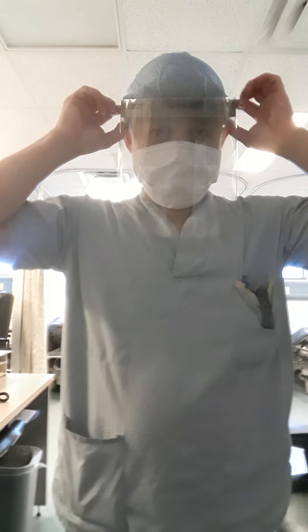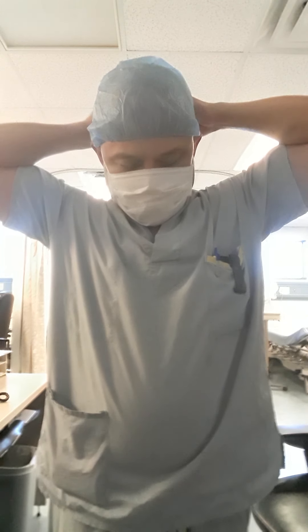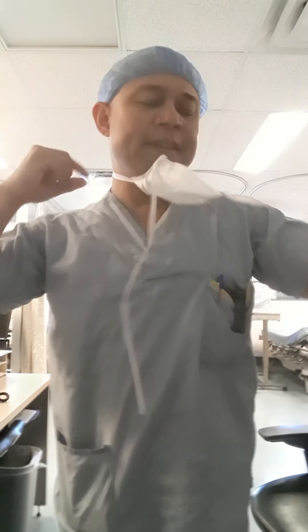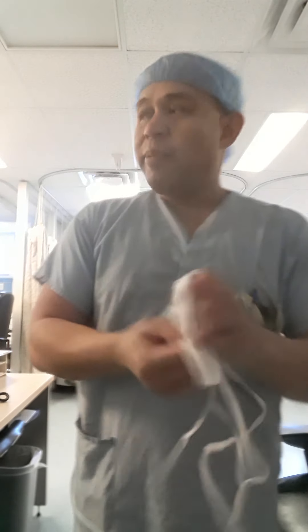There you go — and the face shield, same thing, make sure you put it into the proper waste container. And the last thing is your mask — don't touch the front of it. See, there you go guys — that's the proper way to do a donning and doffing procedure.